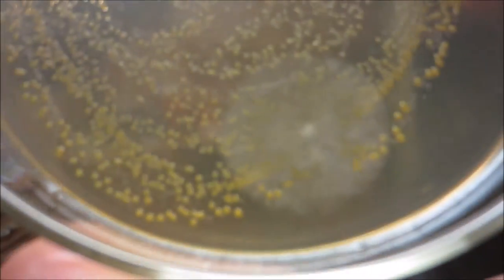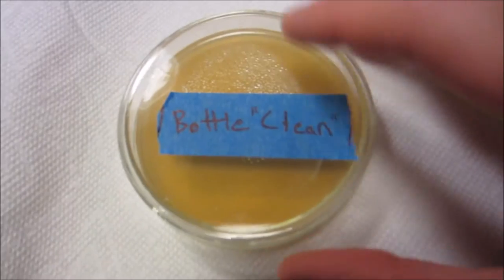Now on to the bottles. The first bottle was completely cleaned, and you can see there's no microbial growth, which is pretty impressive.